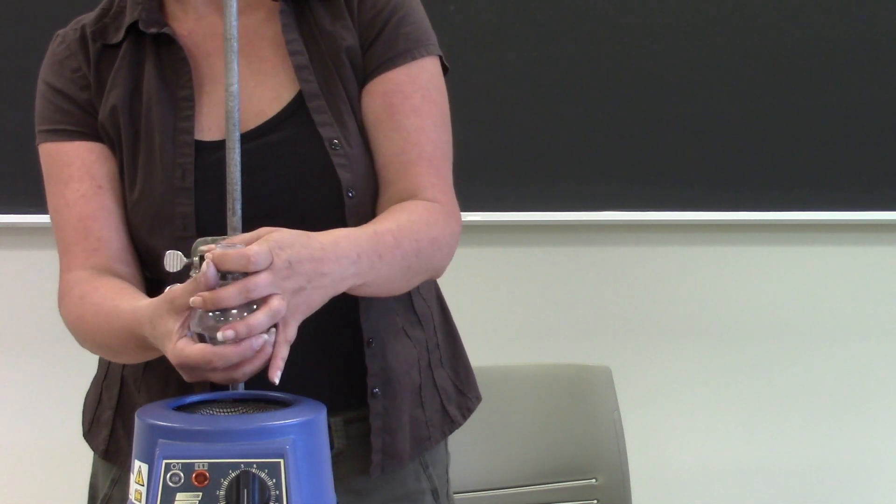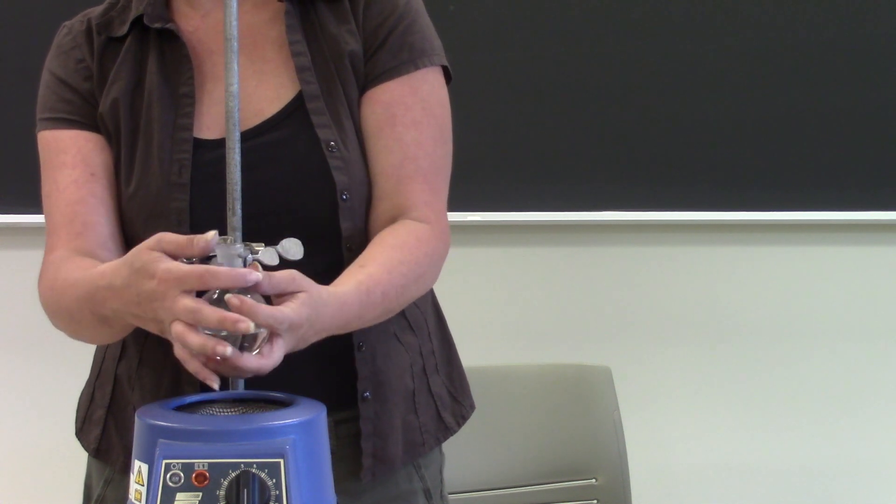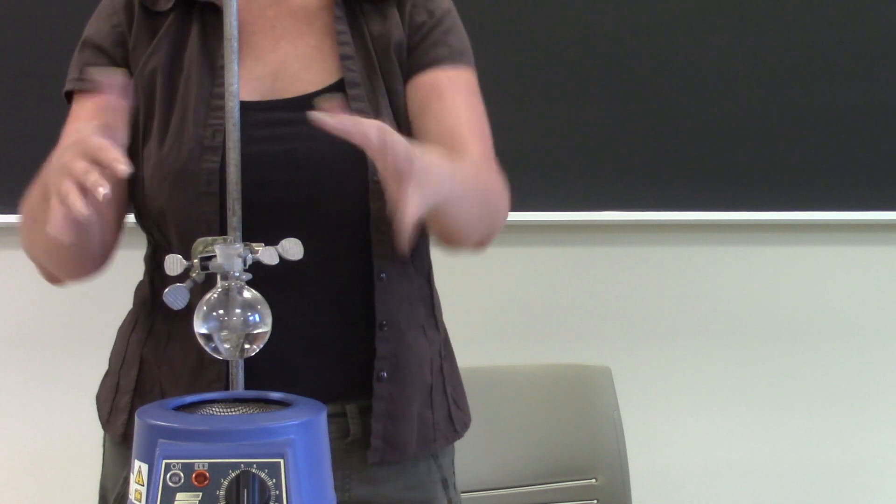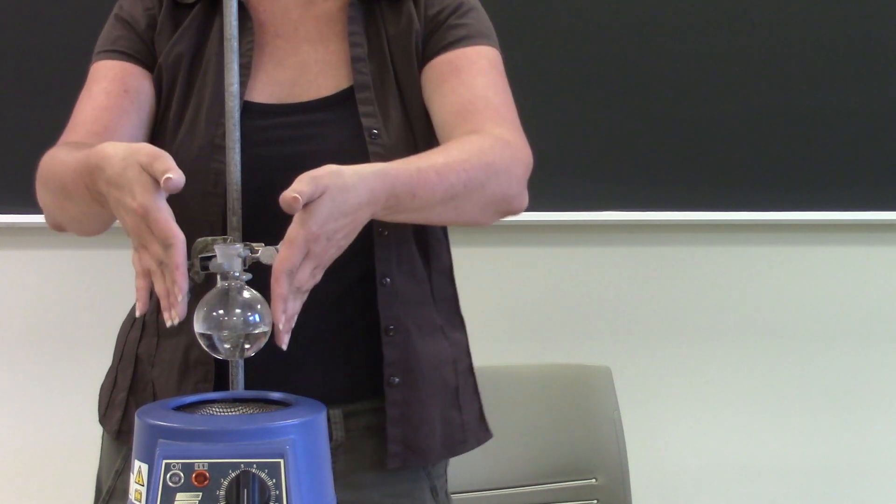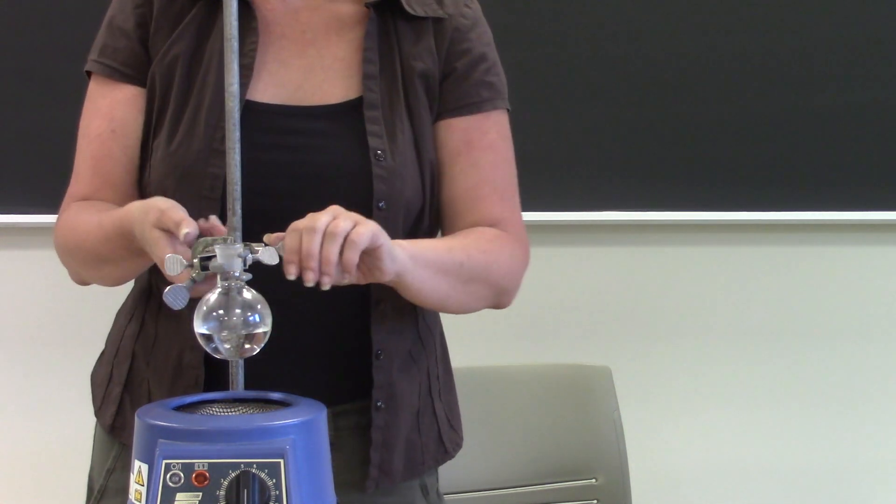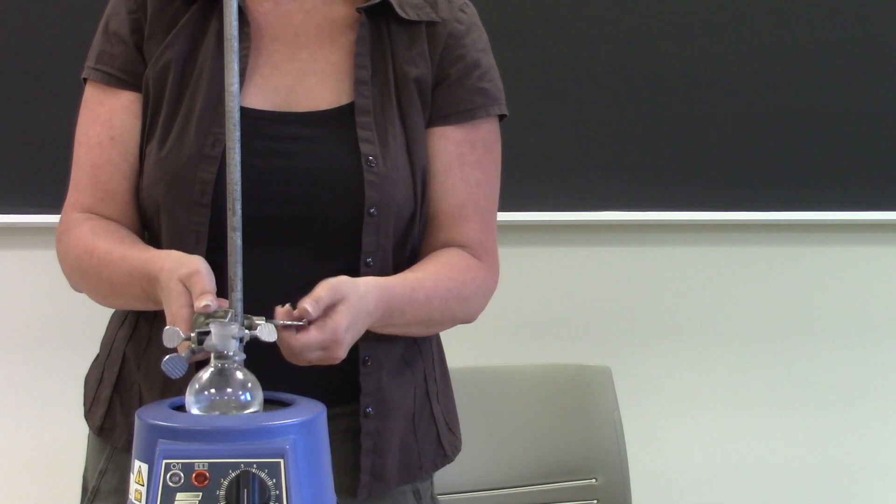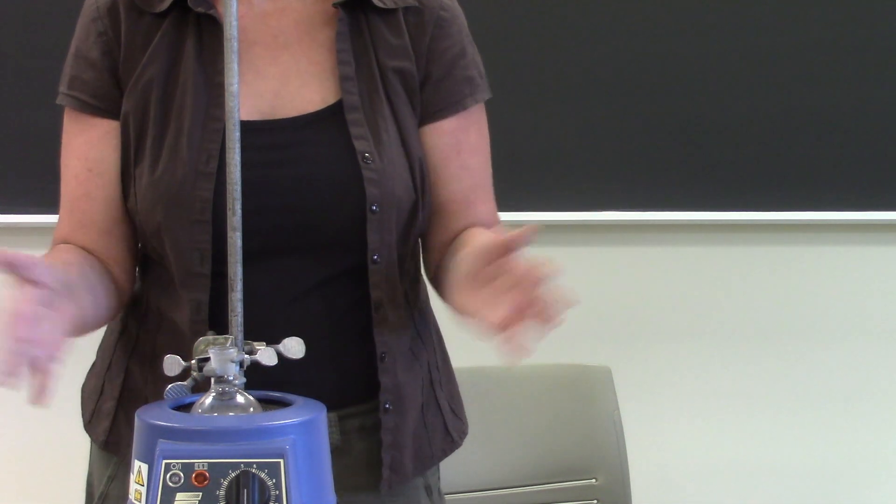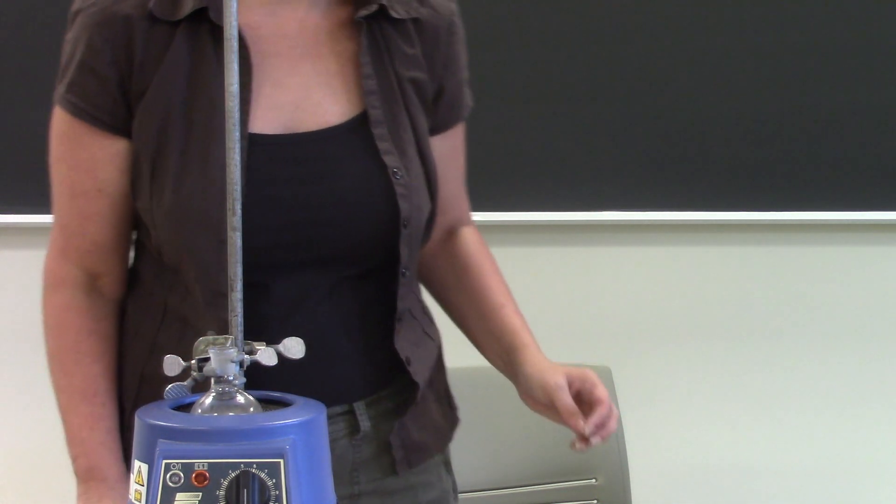The other thing I'm going to do is make sure that the neck of the flask is going straight up and down because you don't want your apparatus to be going off at an odd angle, it should be straight up and down. So now that I've got that really tightly clamped I'm going to lower it into the heating mantle and there's my round bottom flask.